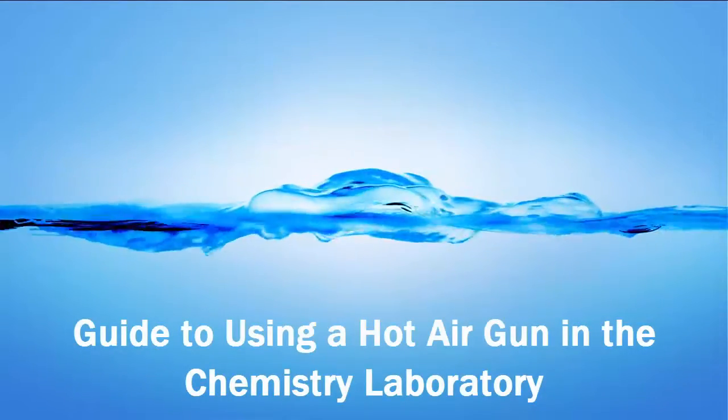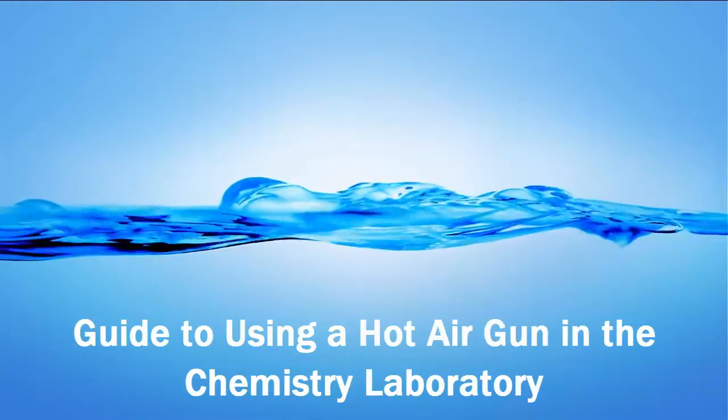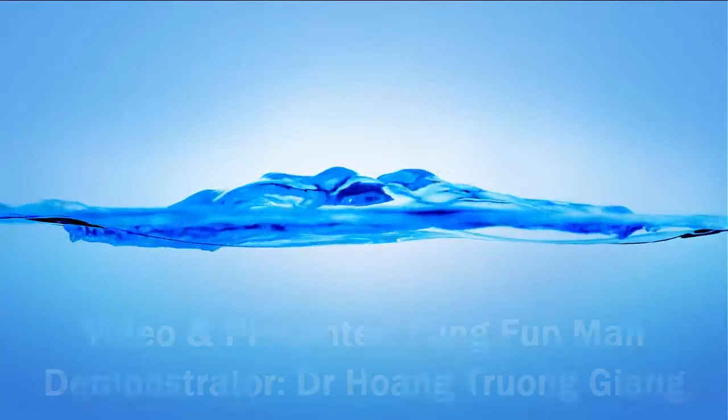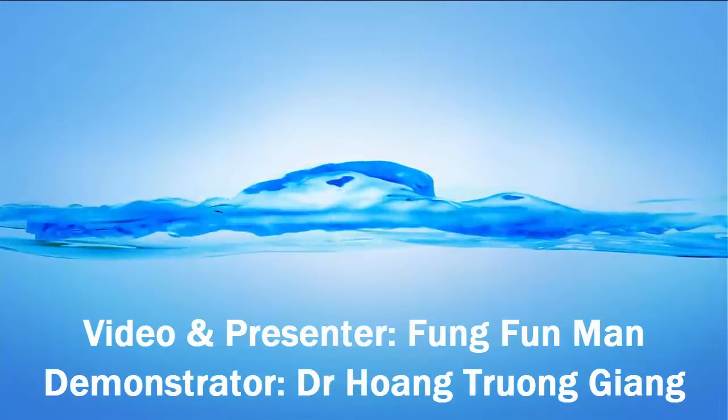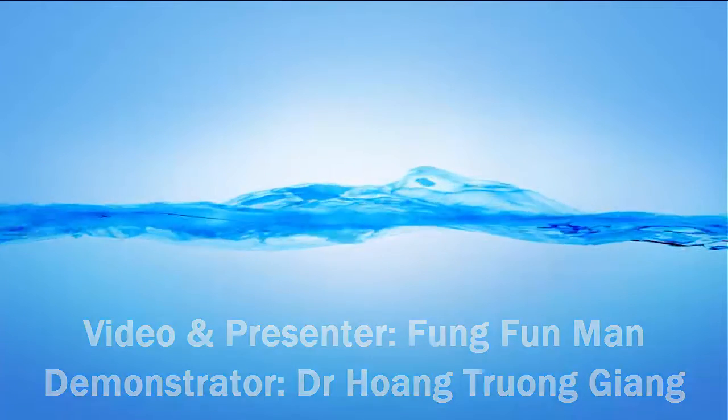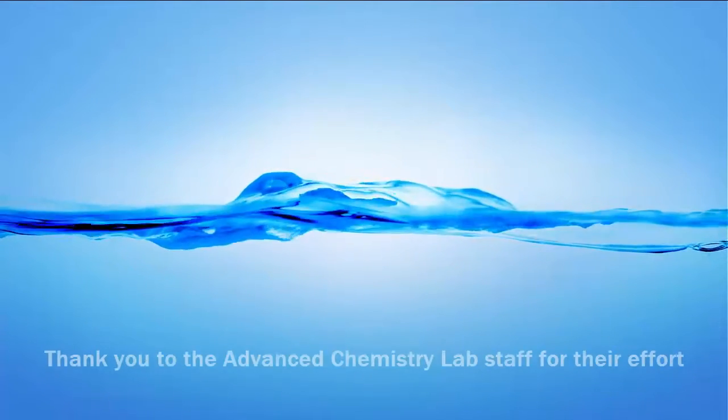Hi, I'm going to demonstrate how to use a heat gun in the chemistry laboratory. Using a heat gun is very important in some reactions because there are some specific reactions that are very moisture sensitive.